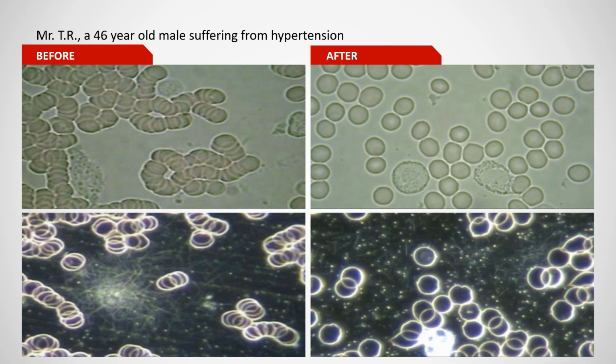Now, I'm sure that most of the attendees are not familiar with what normal blood would look like, but it's quite obvious that the images on the left-hand side, well, they don't seem very normal. So the cells over here are stuck together. Just out of interest, we have a group of thrombocytes here. So that's platelets that are grouping together and actually forming a microclot in the blood while the blood is circulating.